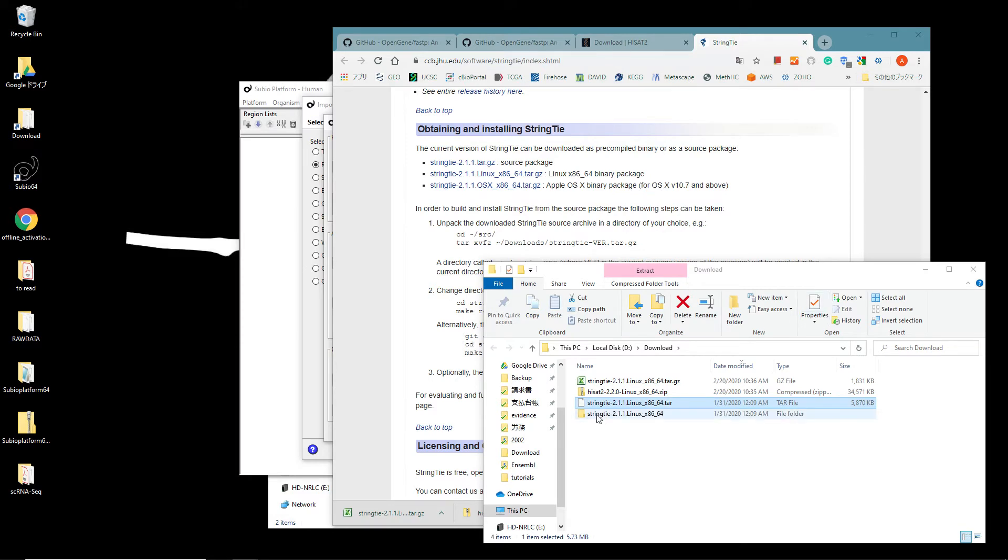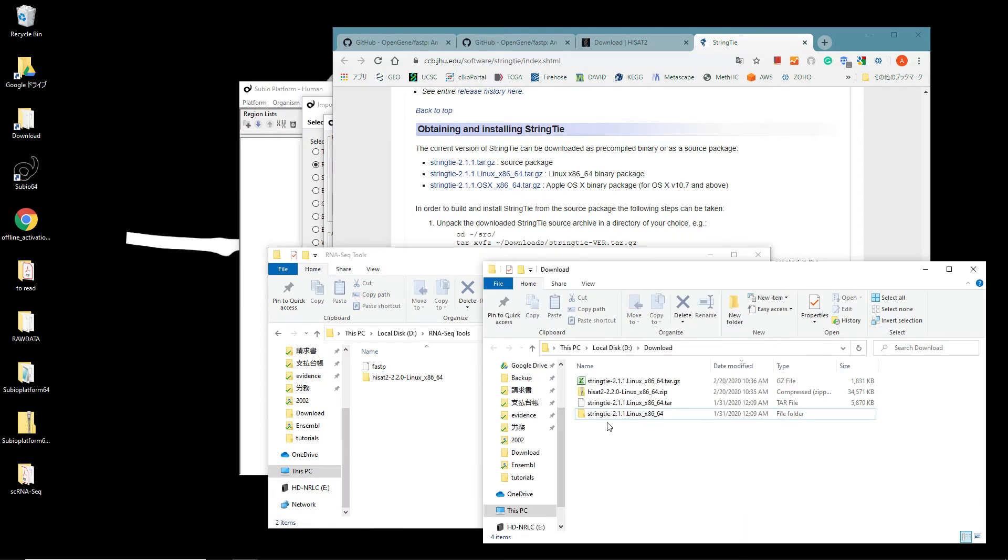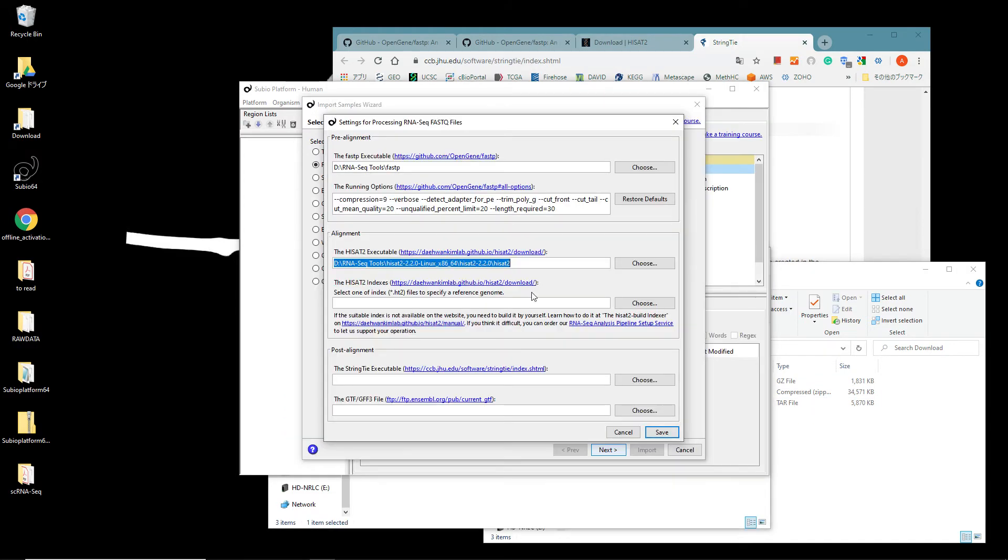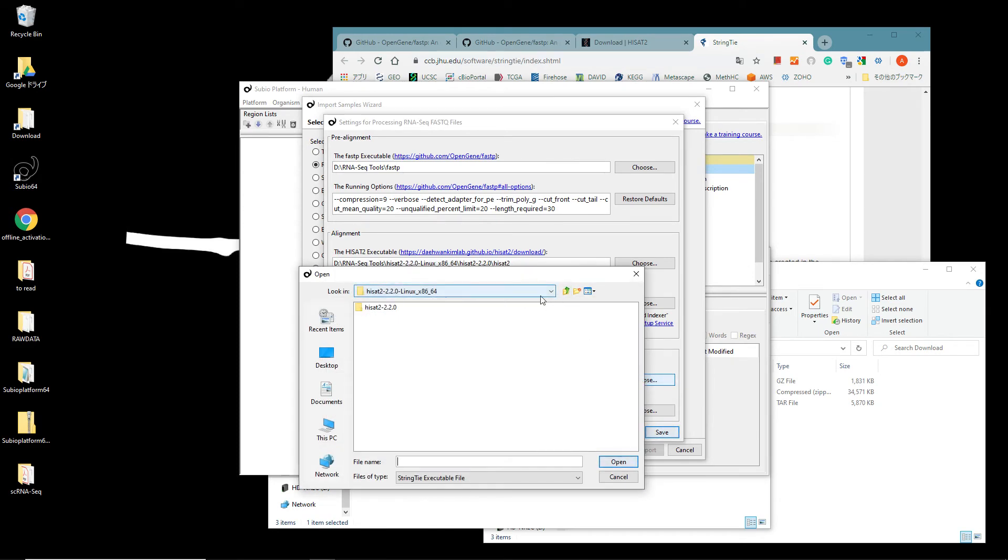Move the extracted folder under the RNA-Seq Tools folder. Go back to the Subio Platform's setting panel. Click the Choose button at the StringTie executable section and select the StringTie file.